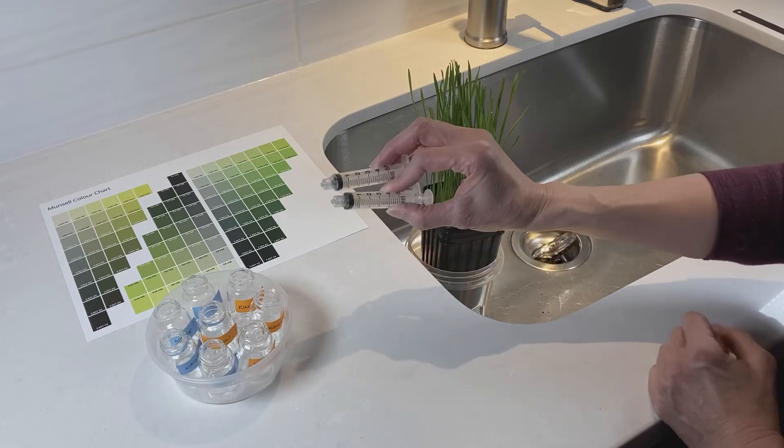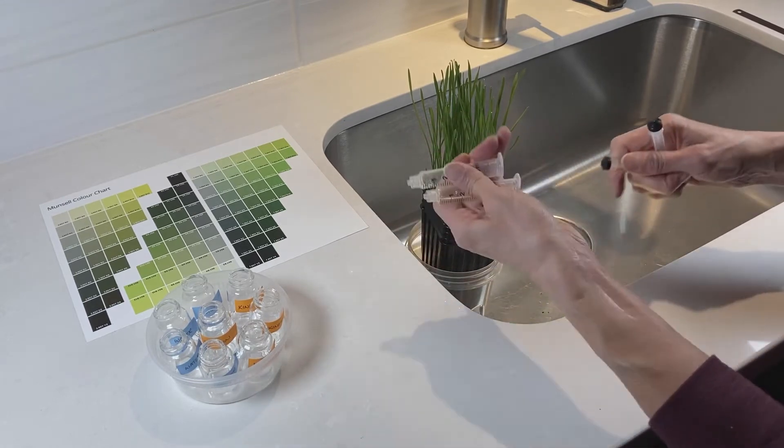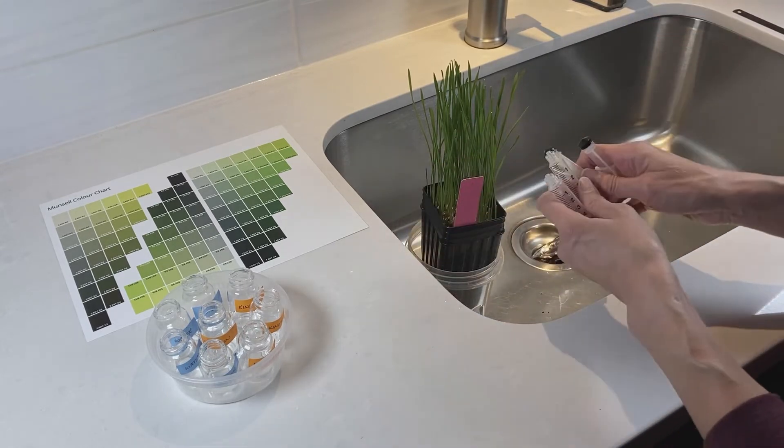Once you're done with the syringes, you can just pull them apart, rinse them under tap water, let them dry, and then return them with the kit.